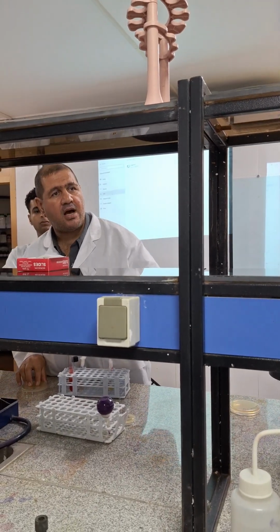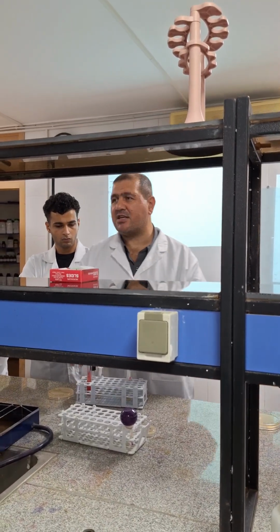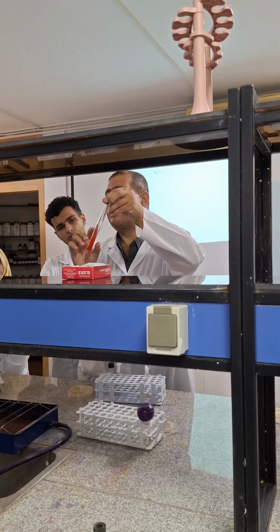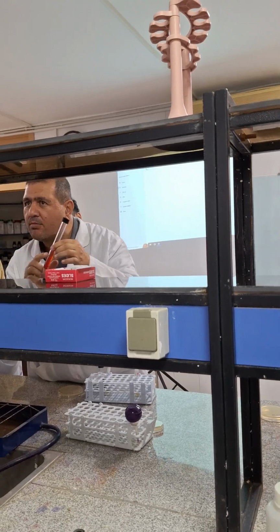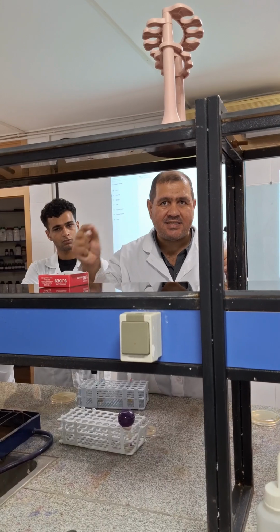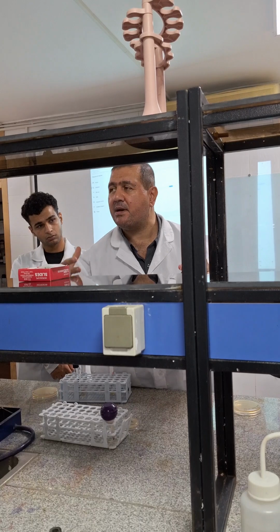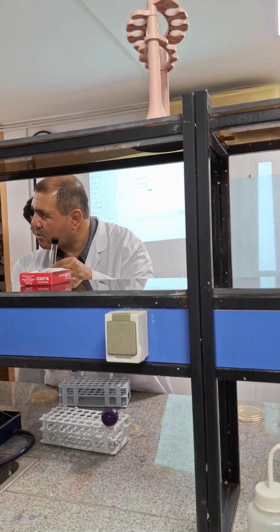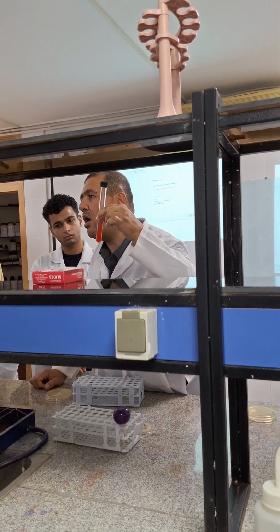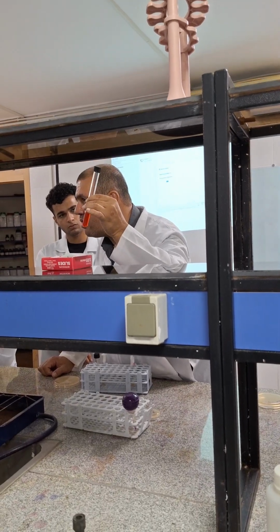The third group of media is selective media, such as mannitol salt agar. This medium contains salt. Salt inhibits the growth of bacteria that are sensitive to salt and allows all other bacteria to grow. For example, Staphylococcus can grow on this medium. So this medium is selective for Staphylococcus. All Staphylococcus can grow on this medium.